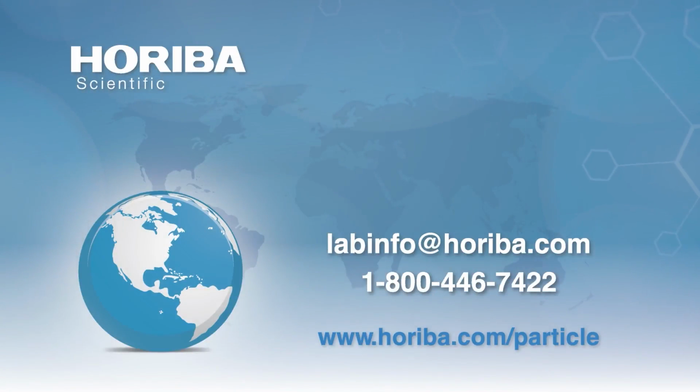So, question 1. How does this technique compare to field flow fractionation? Well, it's one of those things where it's predicated upon the same equations. The way they elected to set up field flow fractionation is a little bit different than this, because they're typically always looking at relatively small particles, but you're still talking about the same principles applying, just a different instrumental design.